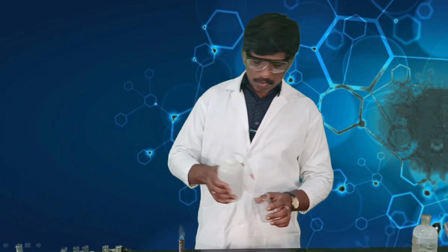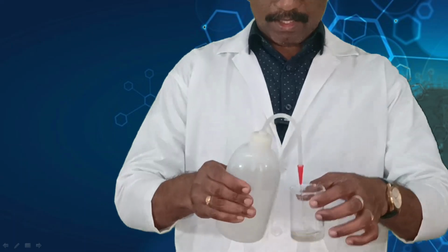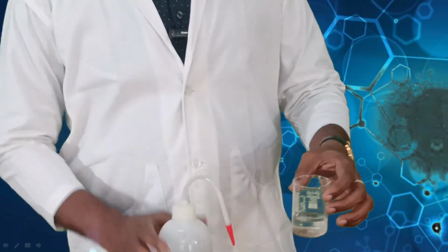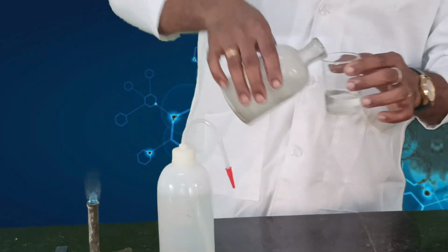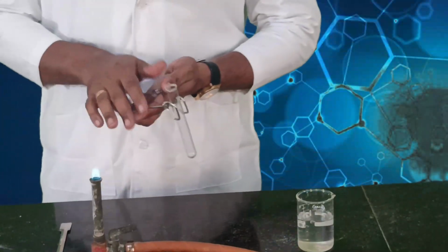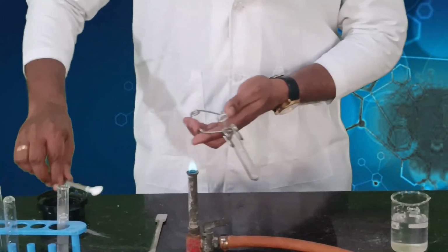In order to do this, before going into the experiment, I have to prepare sodium hydroxide solution. Take a beaker and add water, full of water. Okay, and then add a little amount of sodium hydroxide in it and keep this solution ready before you do the experiment. Okay, I kept the water ready.